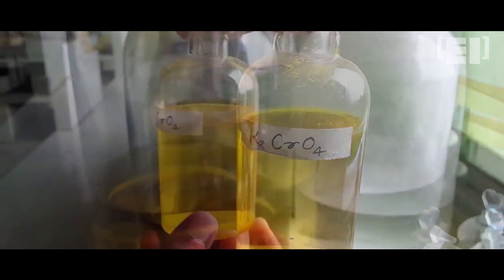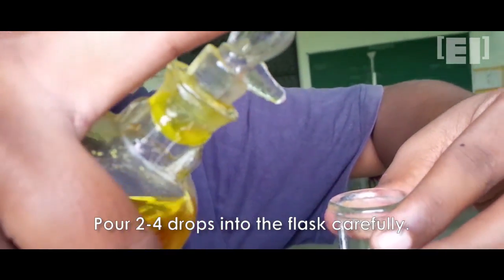Now drop two to four drops of freshly prepared potassium chromate carefully into the flask.